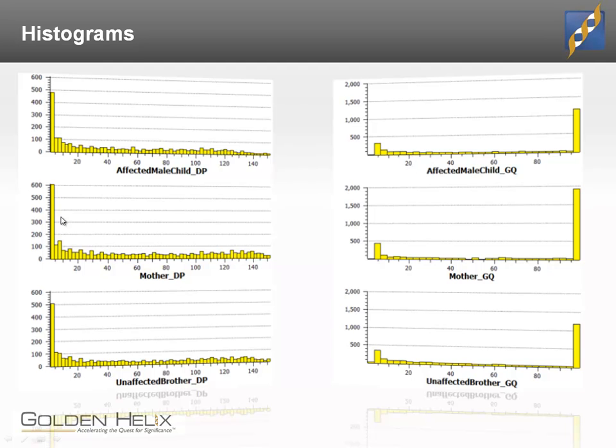It's also worth noting that there is a little bit more total DNA and a little bit higher genotype quality in the mother, who has 2 X chromosomes that are being sampled here, than in the males, which only have 1 X chromosome. So you can see the number of genotypes that are high quality is a little bit higher, and you can see the overall histogram is a little bit larger.